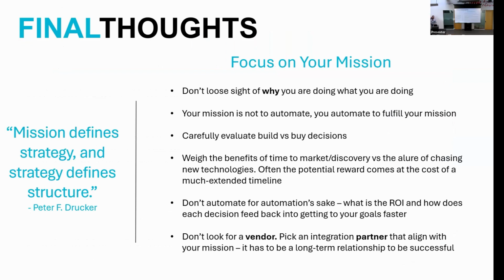So as you can see, there's a tremendous amount of improvement that can happen to lab automation, and the work that we're doing at Hover Labs and Lab Robots are just two of the ways that we can transform the current static paradigms that I was talking about into much more flexible automation solutions.